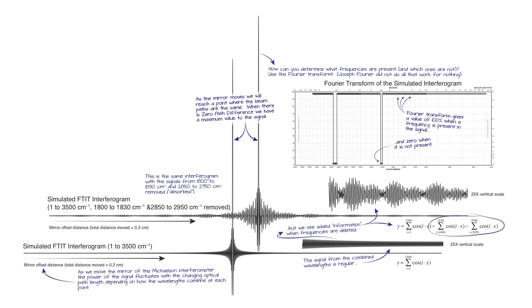I mean, basically, press go, the startup conditions of your instrument are going to be fine. In NMR, there's going to be times all your life in chemistry where you're going to be wanting to mess with the settings in your NMR to find a particular frequency, to zoom in on certain areas, to eliminate water peaks. There's all kinds of tricks you can pull with the electronics of an NMR, and the Fourier transform is going to be part of that.